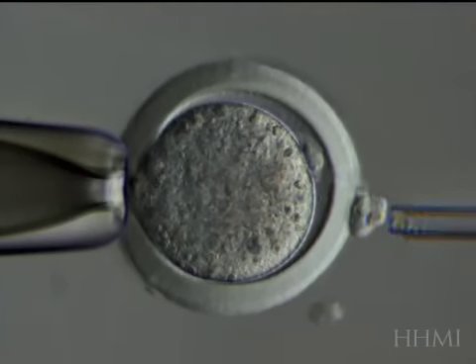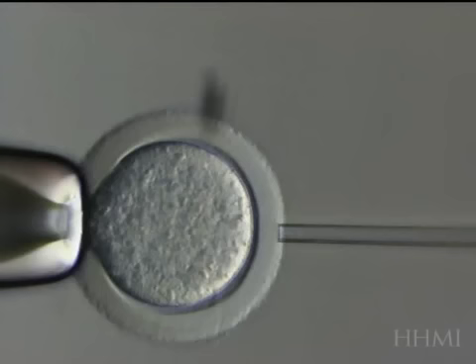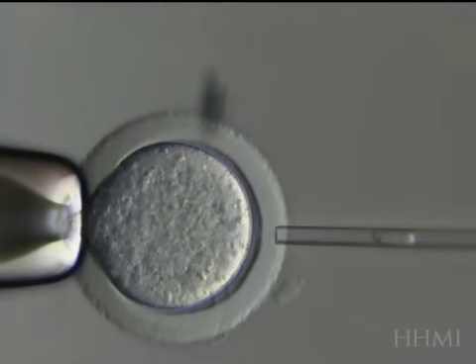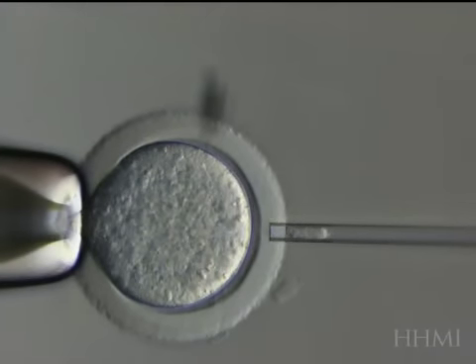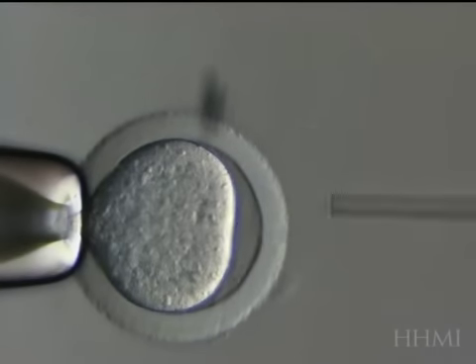So that nucleus is going to be squirted out now because we don't need it anymore, and there we have an enucleated egg. Here we'll see it again — a little hole — and the zona is prepared. Now the nucleus is going to be squirted inside. So there are two examples of what's called somatic cell nuclear transfer.